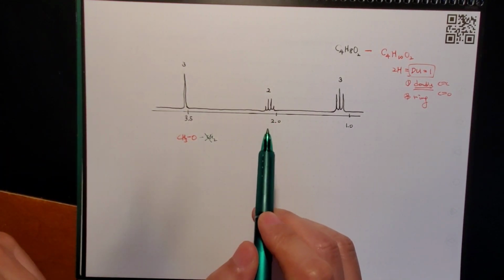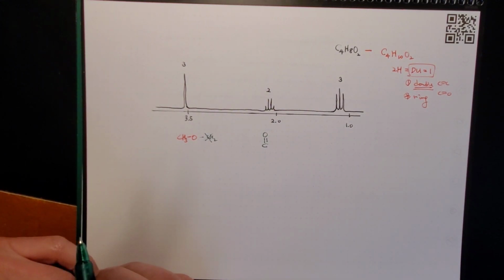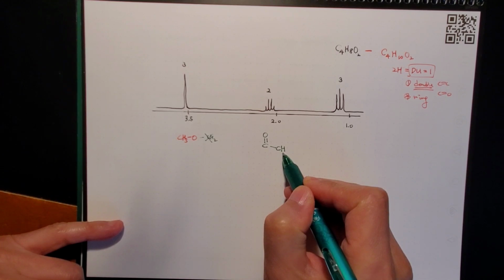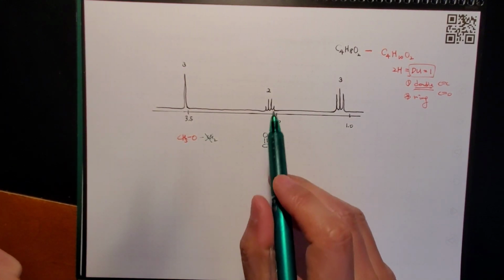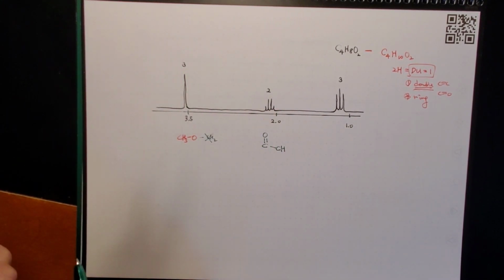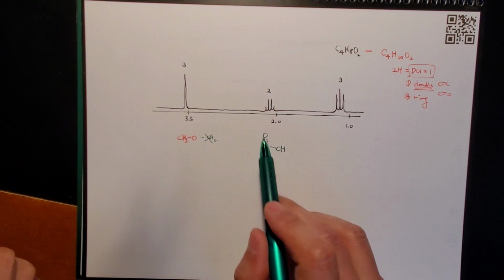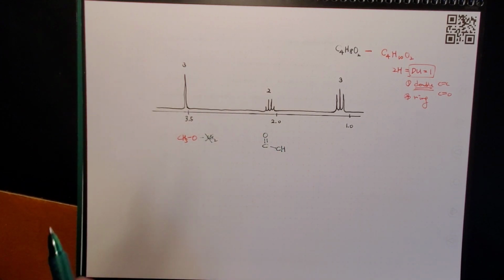That's a typical number. I told you that when you have a CO double bond, then the hydrogen beta to the sp2 oxygen is close to 2.0. It's really common, so it's very useful if you memorize this. Normally the beta is about half of the value for the alpha hydrogen, but when it's sp2, it's a little more, so it comes up to 2 point something.